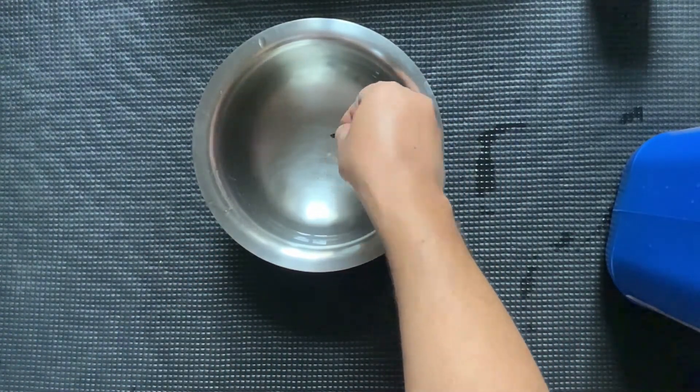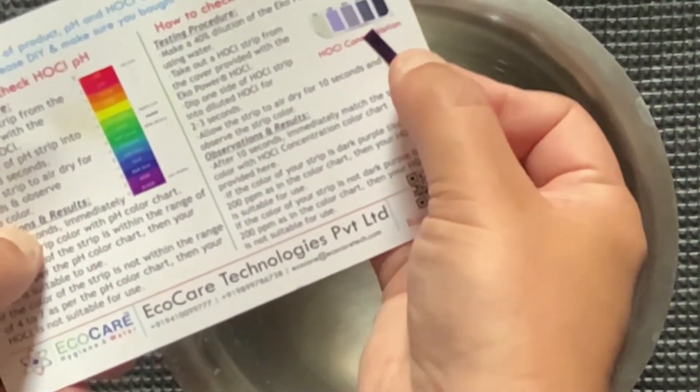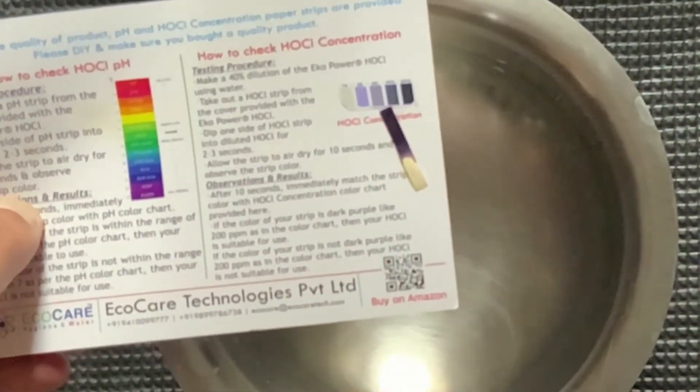The color of the strip shall turn to dark purple or violet color. The color should match with the 200 parts per million color chart provided with the kit.